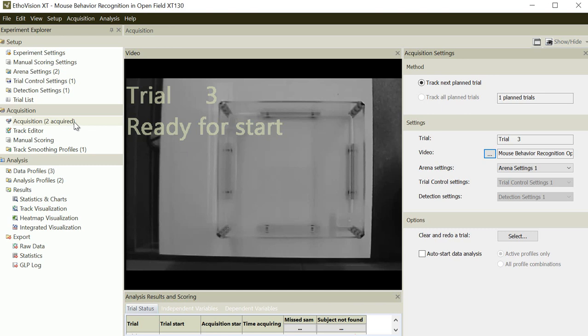But you certainly have a limitation, because this is an evaluation version, and you just try to use a trial. Please excuse us that you cannot acquire your data as long as you like. You have a 1 or 2 minutes time limitation.